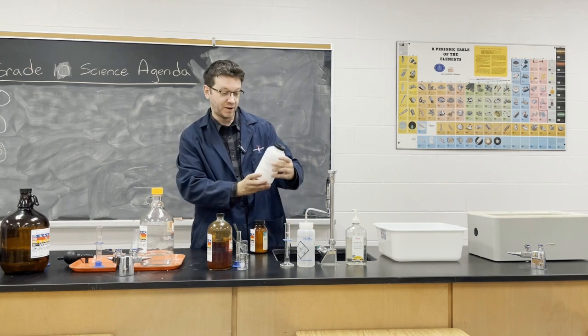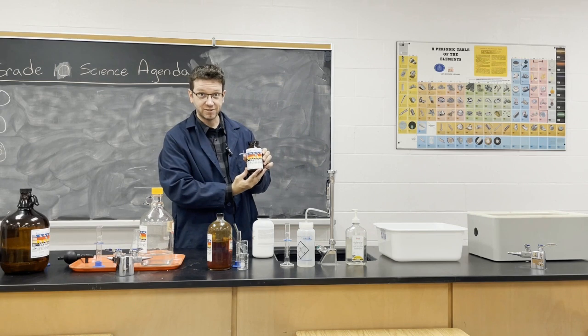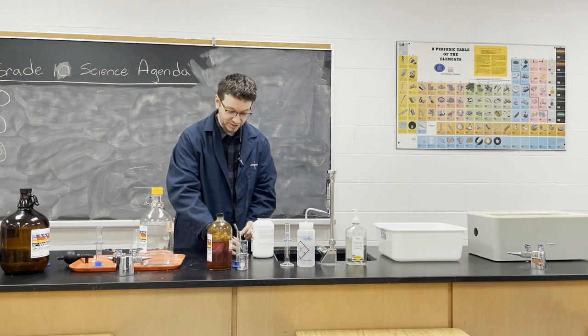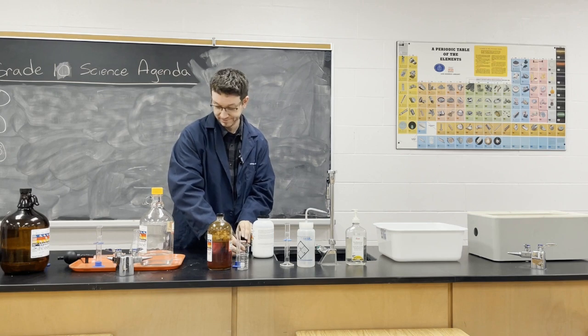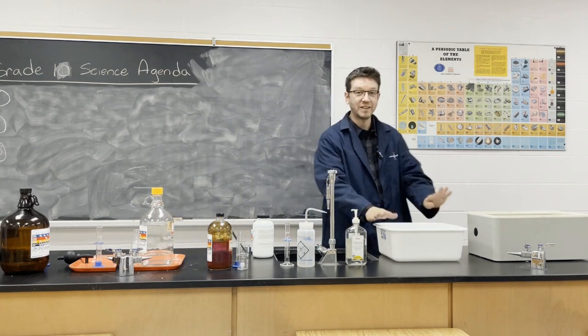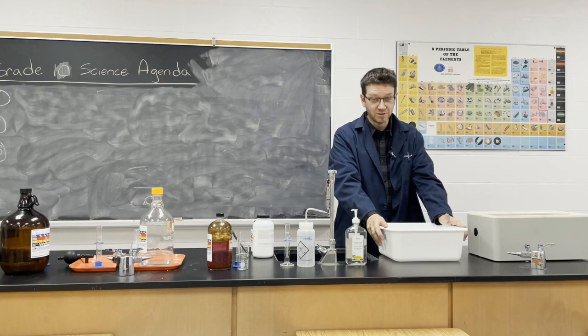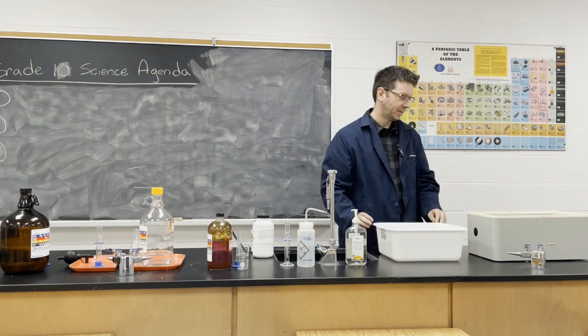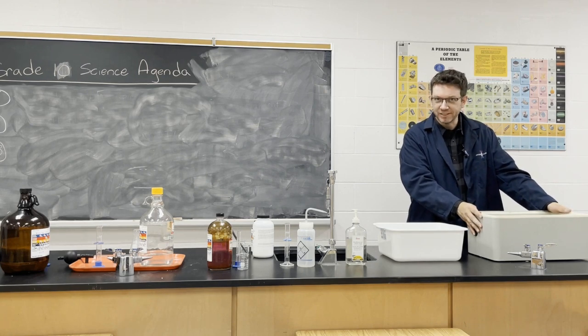And then we have potassium sulfate and manganese sulfate. Both I have with a small beaker and scoopula. Finally, we're going to have a cold water bath or an ice water bath. So just put in a bunch of water and some ice, and then a hot water bath at about 40 degrees is good.